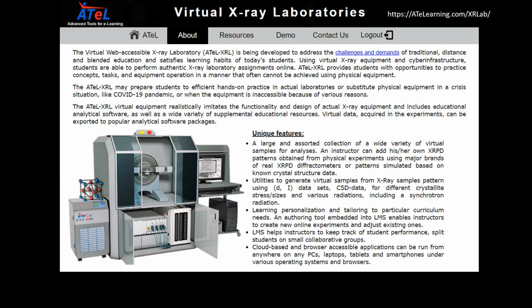The primary goal of the XRD labs is to provide students with the first-hand experience needed for a deep understanding of X-ray diffraction techniques, estimating their precision and limitations, and the factors that affect the accuracy of the obtained results. In the context of online experiments, students are introduced to equipment operation and safety precautions. They will scan specimens and analyze the obtained XRPD patterns to determine structural parameters, phase composition, crystallite size, and so on.